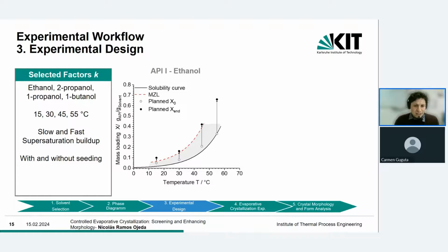We started each experiment with 5 milliliter volume, and we need to ensure a sufficient remaining volume during and after the evaporation. In the best scenario, at the end, we still had volumes above 2.5 milliliter, and in the extreme case, still about 1.5 milliliter. Otherwise, the measuring technique and image acquisition offered by Crystalline would not be reliable.